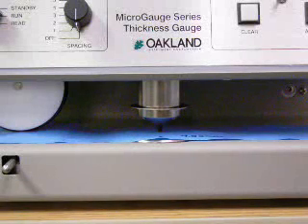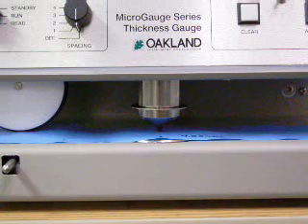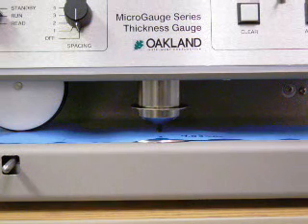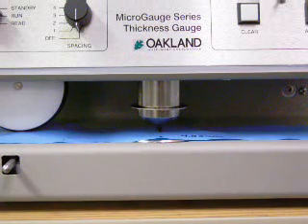The MX micro gauge series utilizes precision LVDT sensors and contact measurement heads to determine the absolute thickness of the material measured. Resolution to 0.01 mil or 0.25 micron and accuracy to 0.02 mil or 0.5 micron are achievable with the systems.